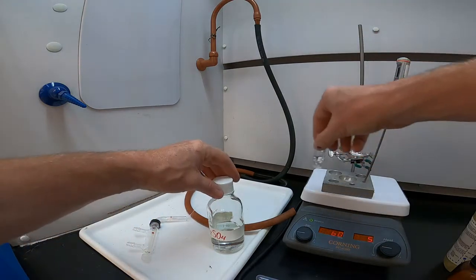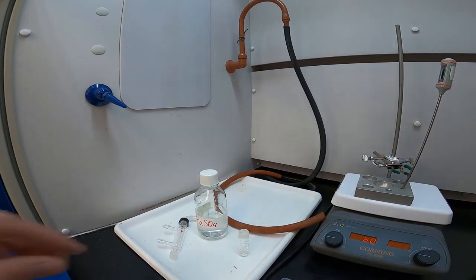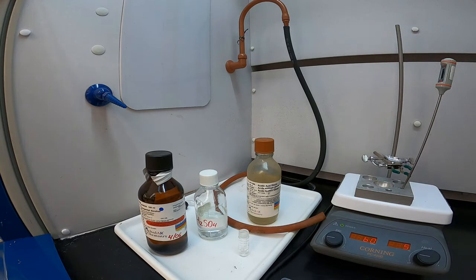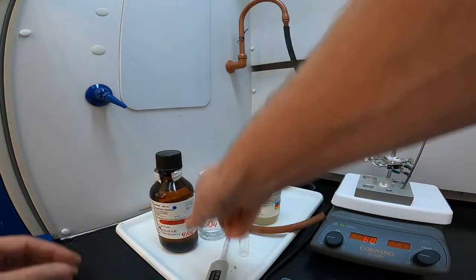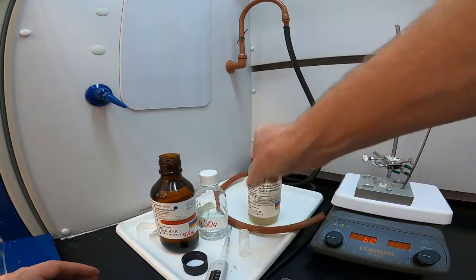So I always do my reactant prep, my chemical measuring, over a tray. So in the reaction, I'm going to use an autopipetter that measures out precisely 1 milliliter of reactant. And what you'll have to do is look up the density of isopentyl alcohol to figure out the mass of isopentyl alcohol used, and use that to later figure out the percent yield based on the mass of product that's created.